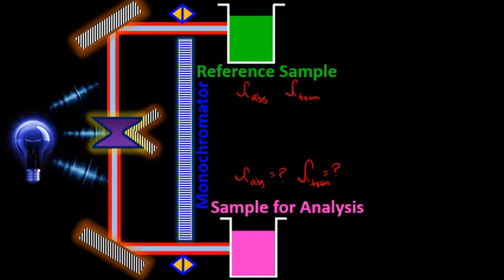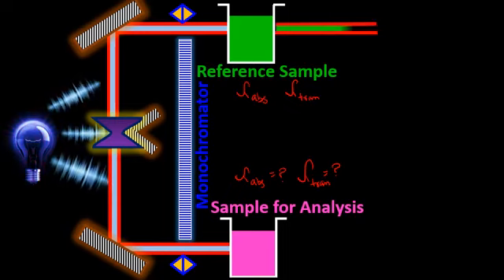So the infrared radiation of specific wavelength will fall on the reference and on the region in which the sample under analysis is present. And then when the infrared radiation falls, it will be transmitted both from the reference sample region and from the analysis sample region.